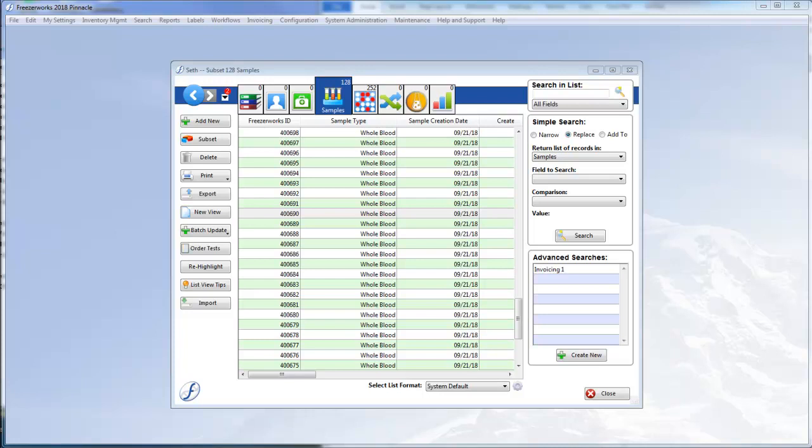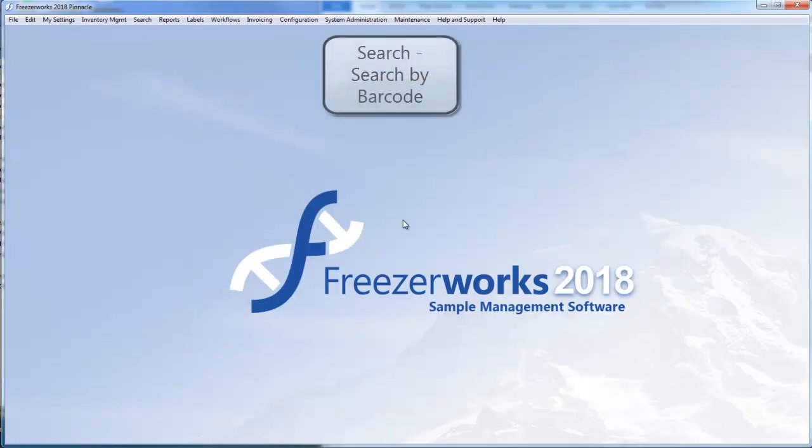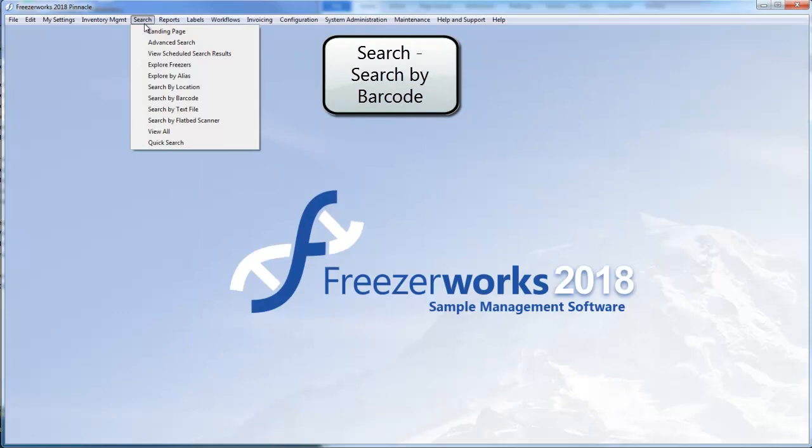Got my scanner, got my vials, and now in Freezerworks we're going to want to open the search menu and select Search by Barcode.